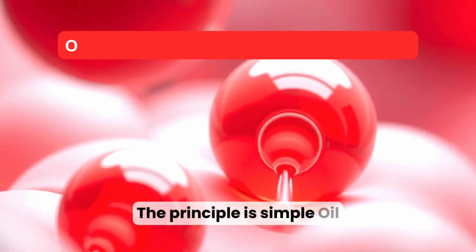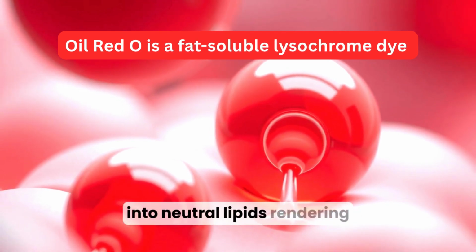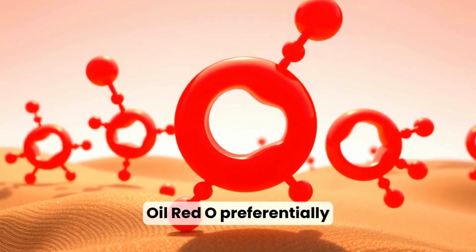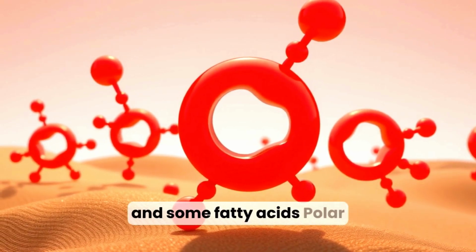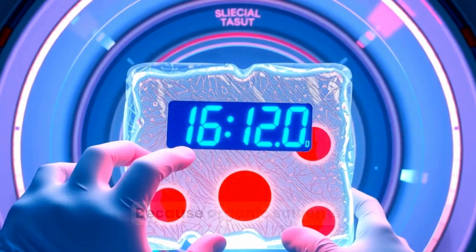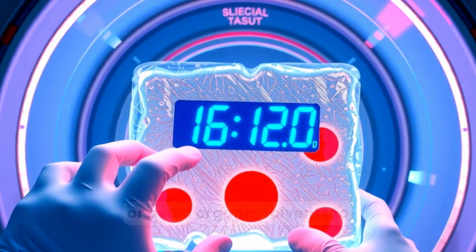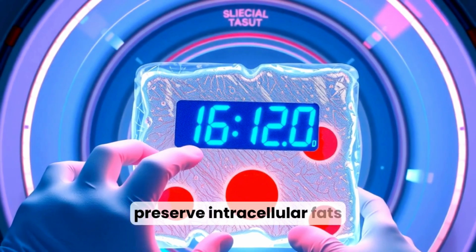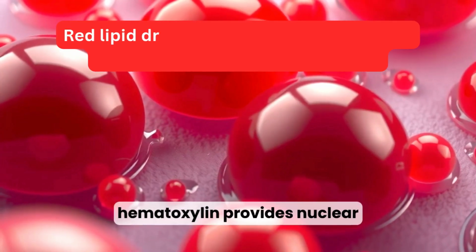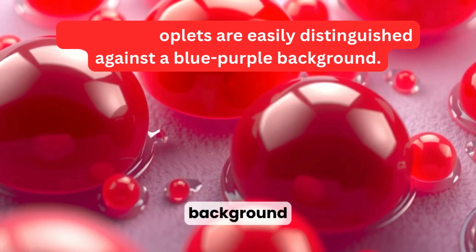The principle is simple. Oil red O is a fat-soluble lysochrome dye that partitions into neutral lipids, rendering them visible as red deposits under the microscope. Oil red O preferentially stains neutral triglycerides and some fatty acids. Polar lipids and phospholipids are less strongly stained by this dye. Because organic solvents remove lipids, oil red O protocols use frozen sections or avoid organic solvents to preserve intracellular fats for staining. A counterstain, typically hematoxylin, provides nuclear contrast so red lipid droplets are easily distinguished against a blue-purple background.